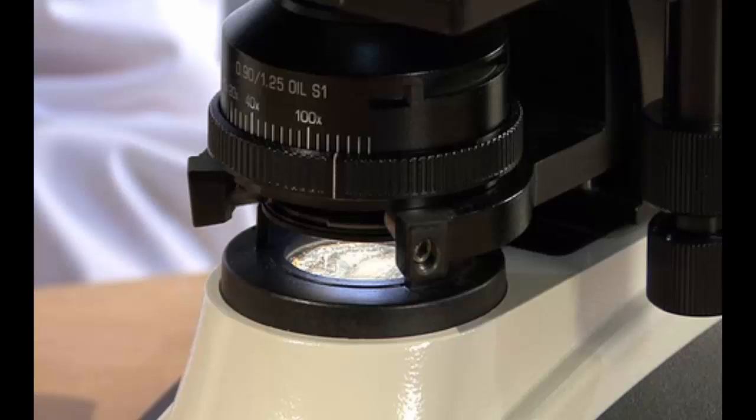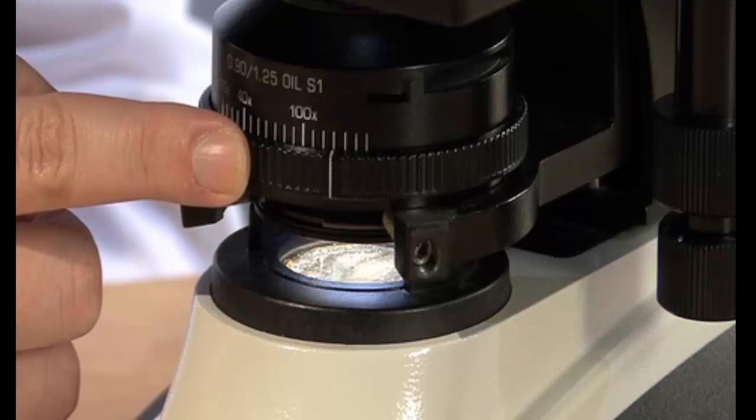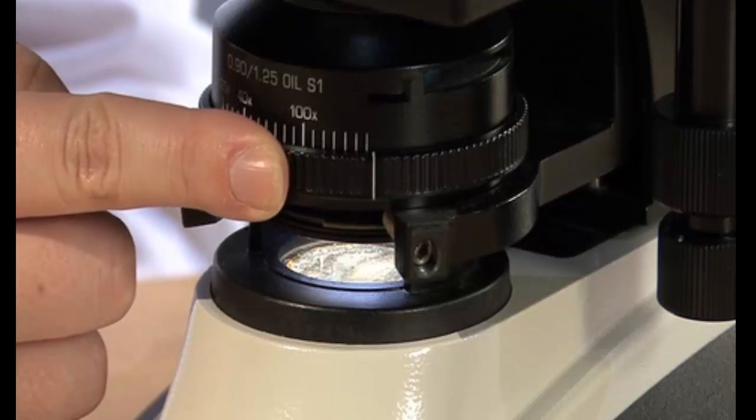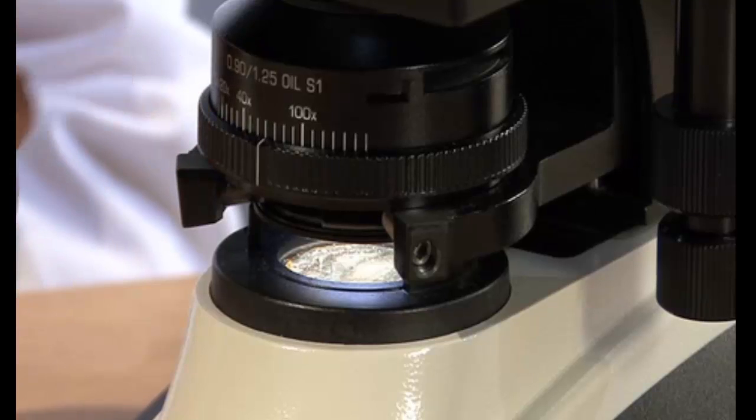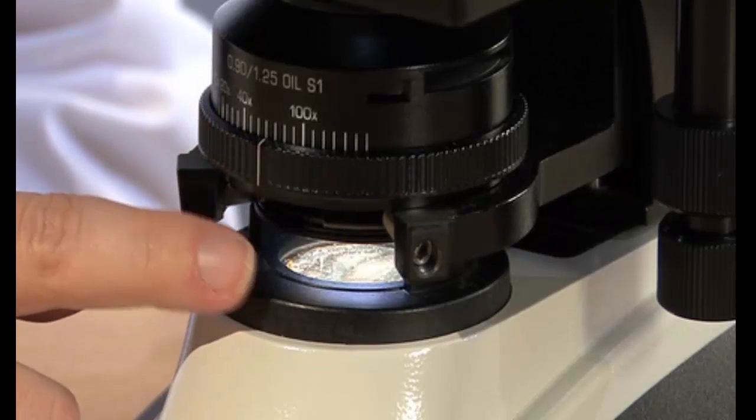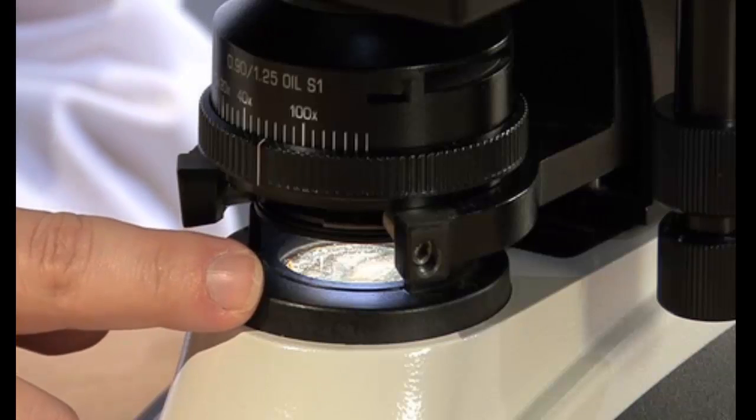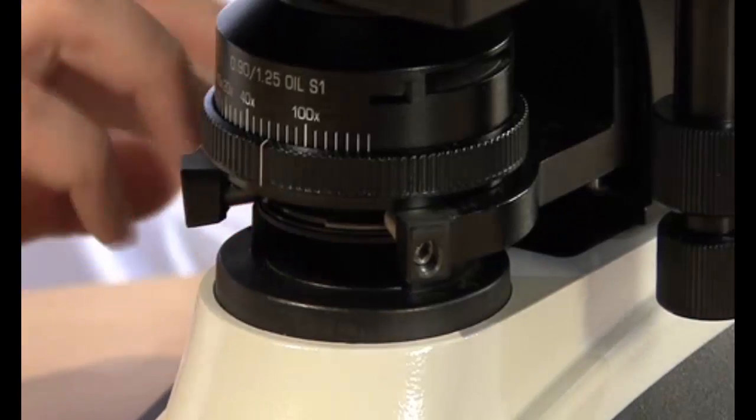Beneath the stage is the condenser which focuses the beam of light on the object. Below the condenser is the iris diaphragm, which controls the amount of light that passes through the stage and onto the specimen itself. At the very bottom is the actual light source and the on-off switch.